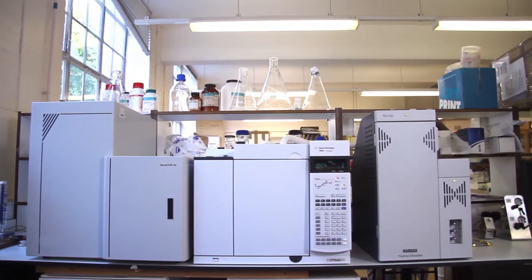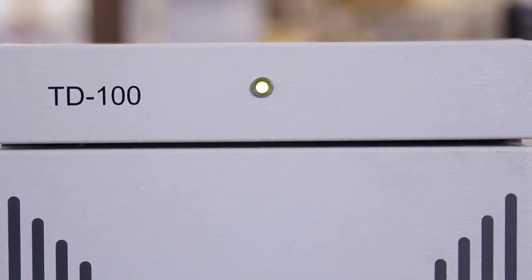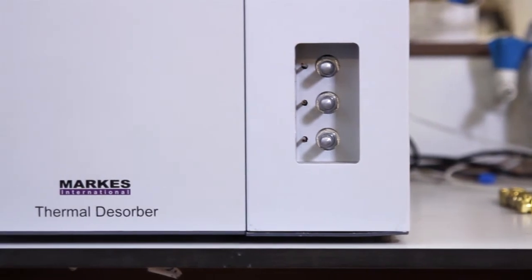The key advantages of this TD-GC-MS-TOF are literally thermal desorption, which allows remote sampling so the sample can be sampled at any time, the headspace or actively, without regard to when it will be analyzed, which is very different to SPME.